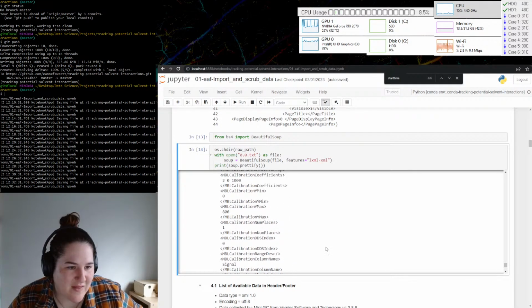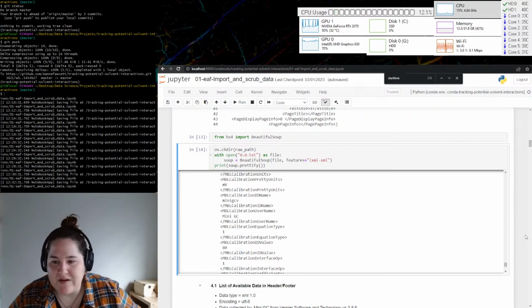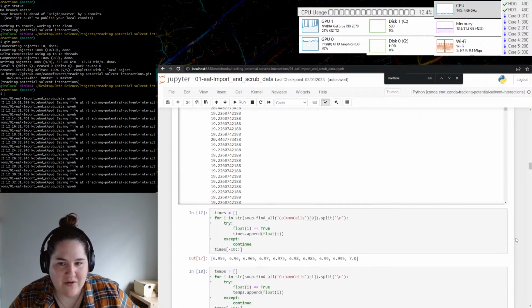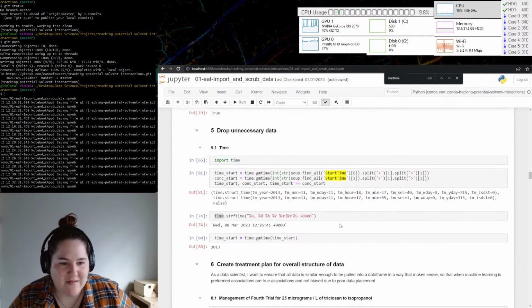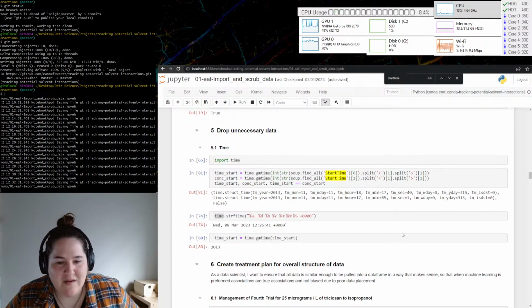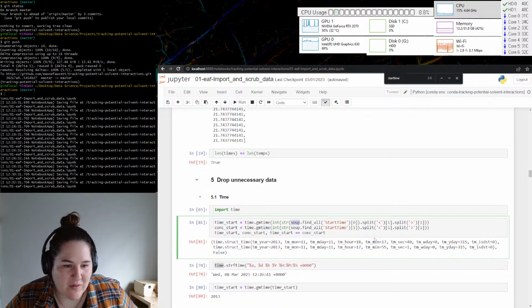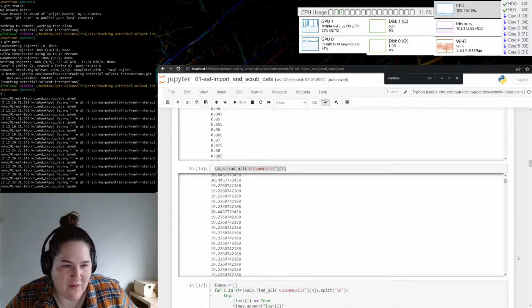This test was designed to last for 7 minutes, and it had a very specific ramp rate. So what I'm trying to think is, I don't think it took 30 minutes, because that's kind of what we're seeing here. It's not 30, it's like 24 minutes or something for the GC to cool down again. I don't think that was time beginning and time ending. I genuinely think these are different collection times. That's crazy to me. So I am very curious, because this is only for one. This soup is only for one thing, right?